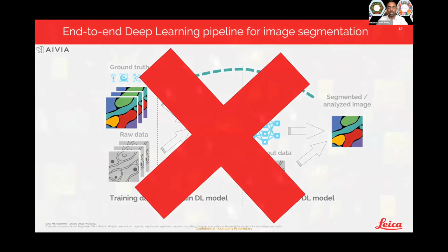So typically, the images go in, and they look a little bit like this. These are fluorescent images of neurons, just happens to be neurons, like the example I have. You open whichever is your favorite software, take an image in, and then you do lots of things to the image. I'm talking about standard image processing, not AI. You can maybe do a pre-processing step. You might apply some thresholds. You might apply some filtering after for detecting just the objects of the right size. You might even do some associations, and then you have a result.